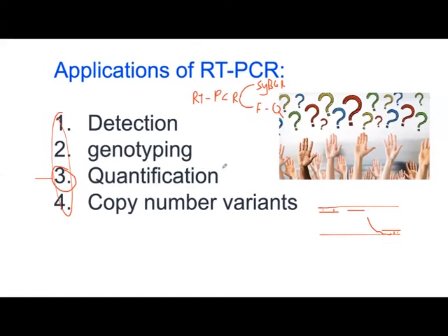Does temperature affect the quality of the sample? I didn't get that question, but if you're talking about sample quality, remember that DNA is more stable than RNA. Usually with DNA, if you have a very good and clean extraction method, you can keep the DNA at room temperature and you can ship it within a week if you want to send it somewhere else. So that's not a problem. We do get samples from Kuwait, from Iran, from Iraq, because sometimes we do some work with samples and we ask them to send them at room temperature. And this is provided the DNA has been extracted.